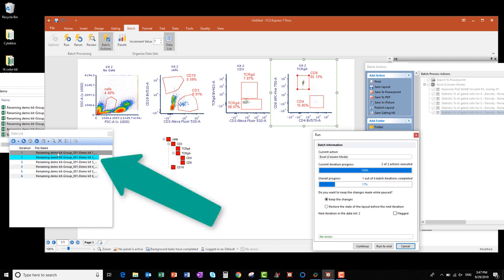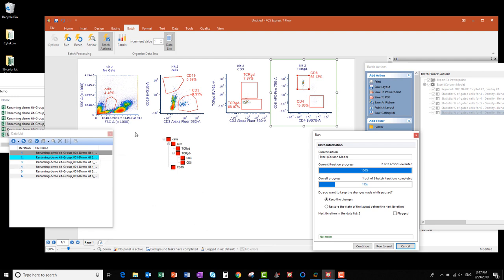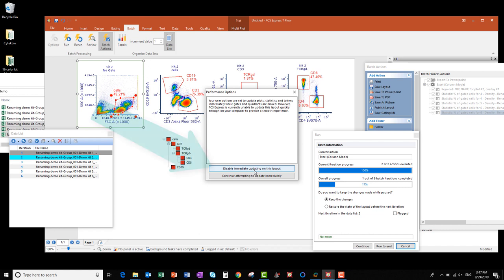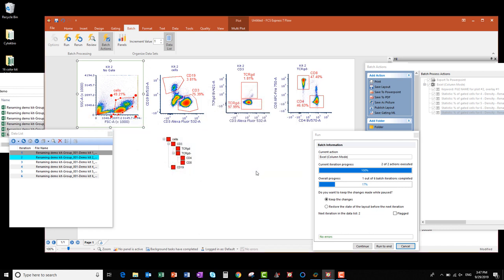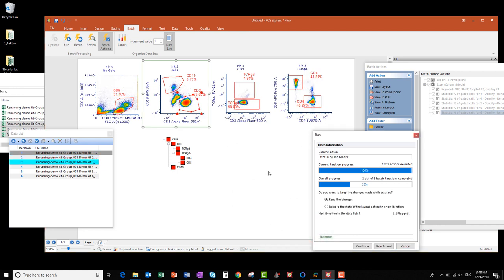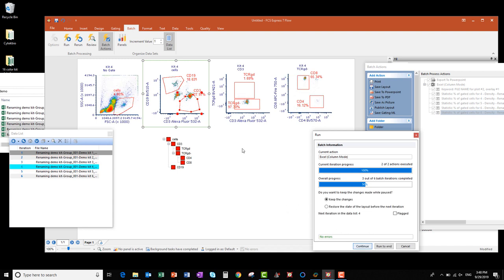Once the first file is processed, you'll notice in the data list that now the second file is highlighted in blue and its data is displayed in the layout. While the batch is paused, I can reposition my gates, starting with my Cells gate, to include the cells that I want inside of it. If you get a performance options pop-up, go ahead and click Disable Immediate Updating on this layout to give your computer's processor a break. I'm going to reposition a few more gates, and then when I'm happy with them, I'll click Continue to move to the next file. I'm going to keep stepping through each of my files, checking the gate placements and adjusting them if needed, and clicking Continue to move through to the next file until I've gotten through all of them.